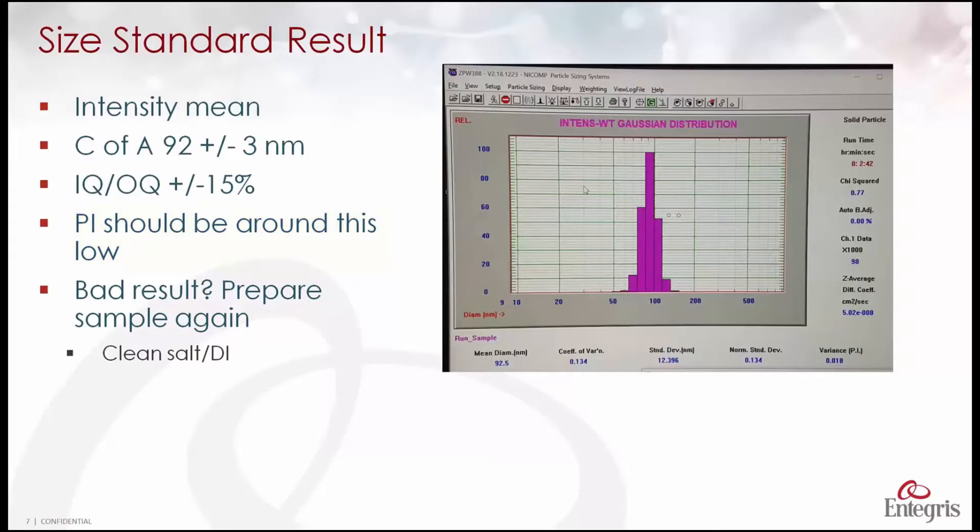Now if you didn't achieve a good result, usually this would mean that it's too large. That means it's usually something associated with the standard. Either it has aggregated or we need to work on the sample preparation.